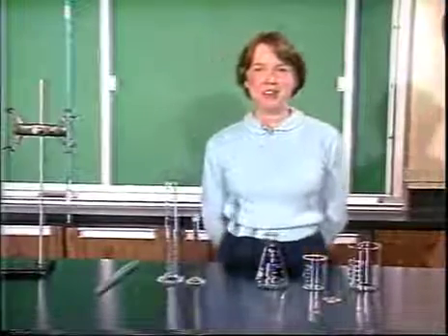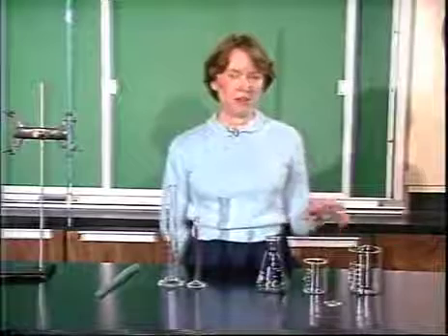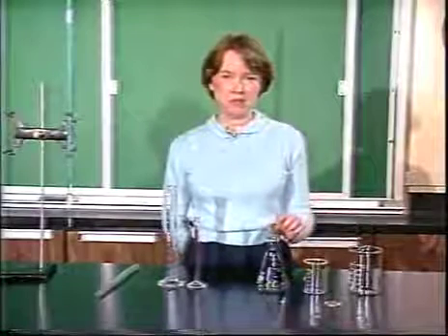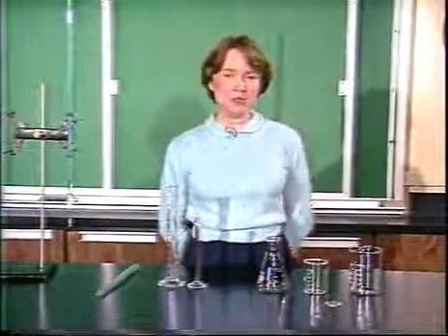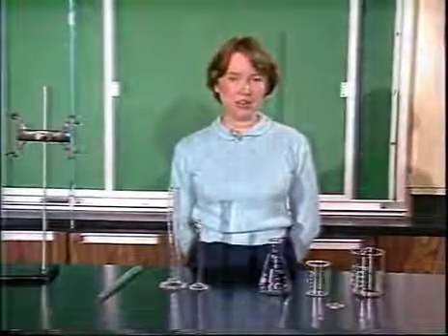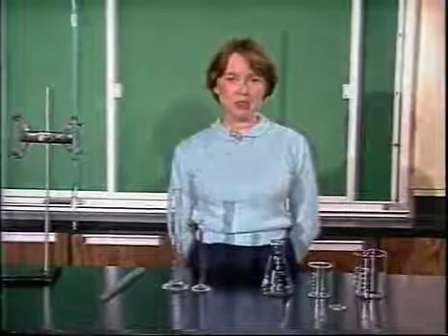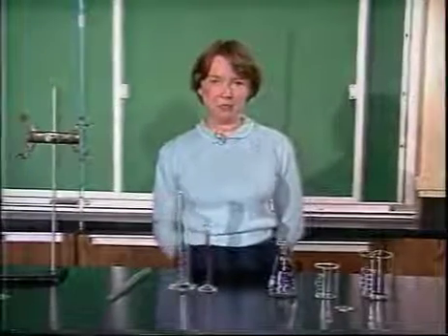As we have already said, volume is a measure of the space occupied. Most pieces of laboratory glassware have volume gradations marked on them, as do these two beakers and this Erlenmeyer flask. As we said earlier, the volume gradations on these things are not particularly accurate. And when we wish to accurately measure volume, we use special pieces of glassware designed for that purpose.